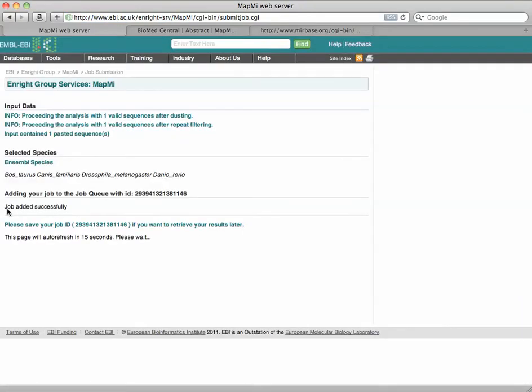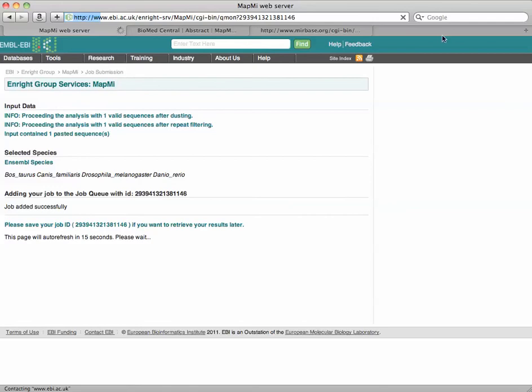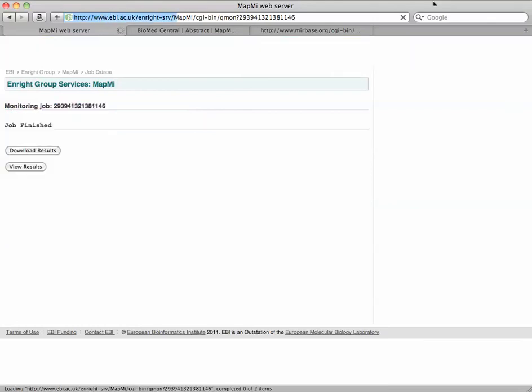As you see, my job has been added and it will take a while to search those genomes for my mature sequence, to see what we find in either Drosophila, fish, zebrafish, dog, or cow. So we'll come back here in a second when those results are complete.